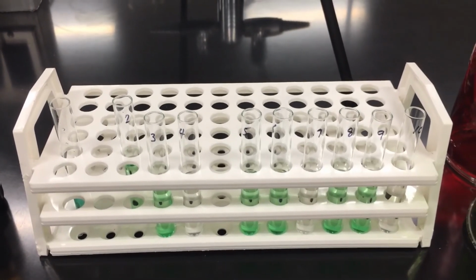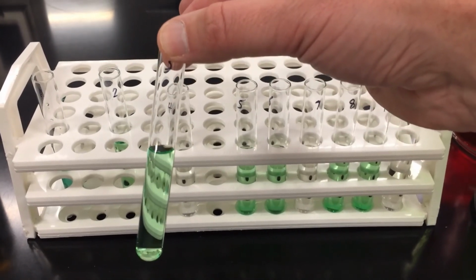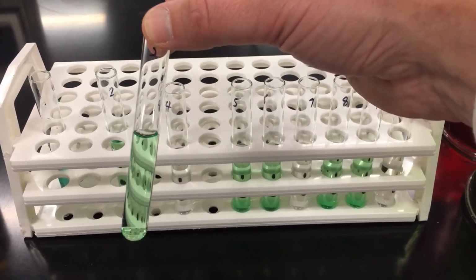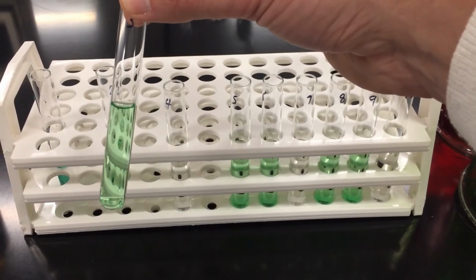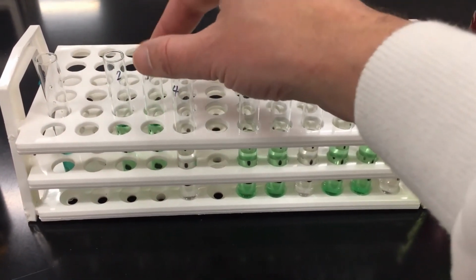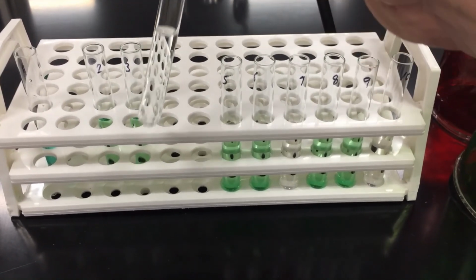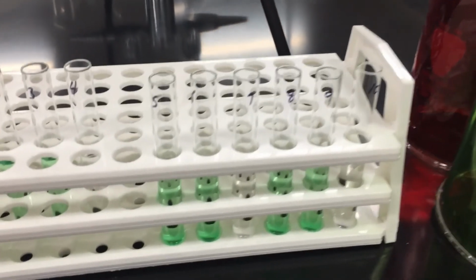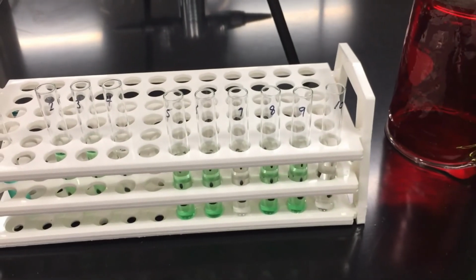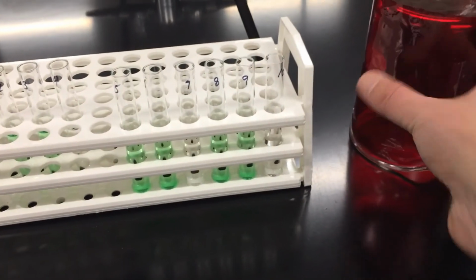So once the first blue test is done, I'm going to move on to test tube 3. Test tube 3 has chloroplasts in it, but we're not going to add DCPIP to this one. This one is going to be water only, and it will be treated the same way. It will be vortexed, added to the cuvette, measured at time 0 and 3 minutes. Test tube 4 is a control that has no chloroplasts in it, but will have DCPIP. Once I'm done doing the blue test, I'm going to move on to test tubes 5, 6, and 7, and 5, 6, and 7 are going to use the green filter instead of the blue filter. Test tubes 8, 9, and 10 are going to use the red filter instead of the blue or green filters.